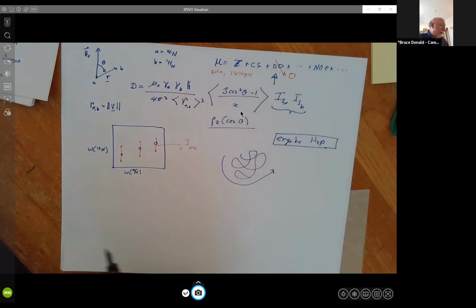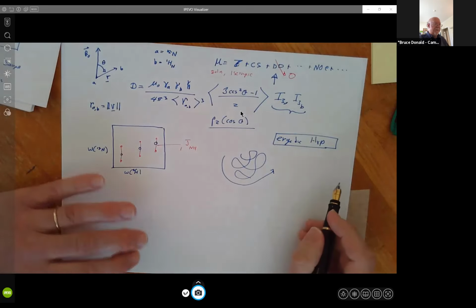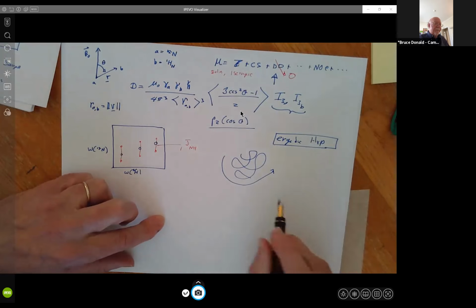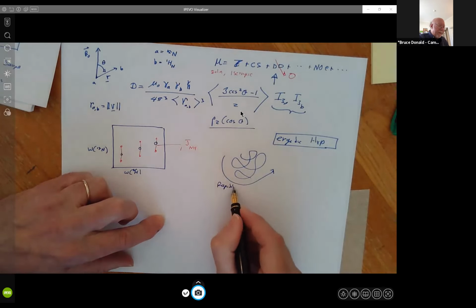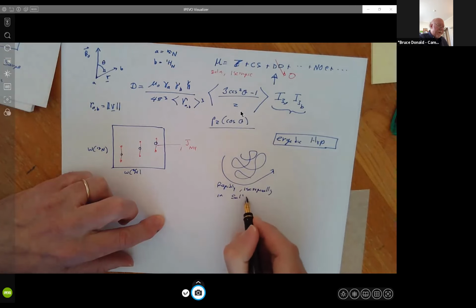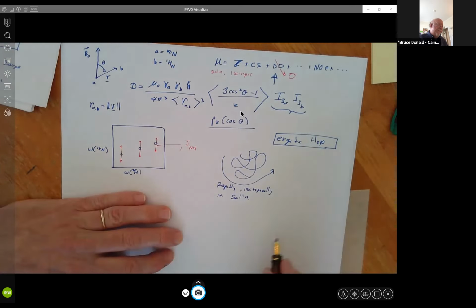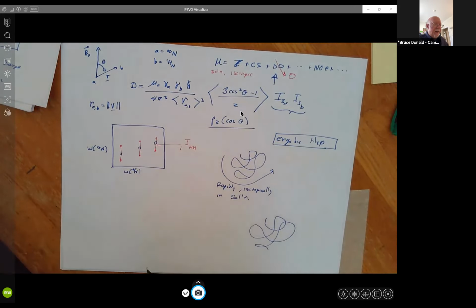And so what a bunch of people figured out, this comes from the liquid crystalline world in some sense, but really Ad Bax at NIH and James Prestegard at the University of Georgia figured out that instead of this tumbling rapidly and isotropically in solution, what you could do is prepare a special biochemical bath in which you have the protein, but you titrate in media that partially align it. And what's the intuition for this?